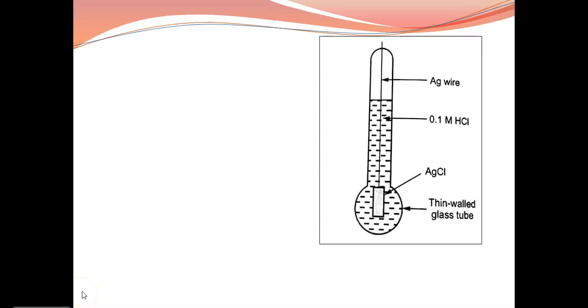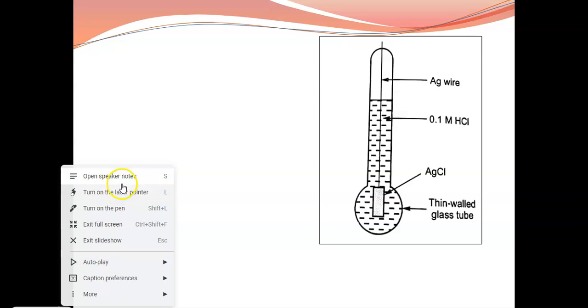Hello everyone, this video is about glass electrode. In the previous video we had discussed the types of electrode and we had seen the secondary reference electrode, which is the calomel electrode, in detail.